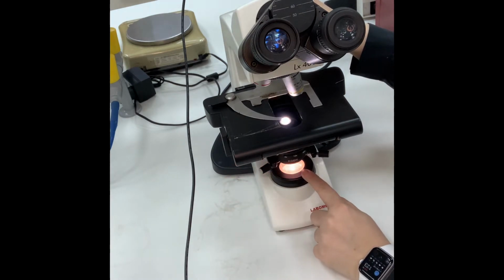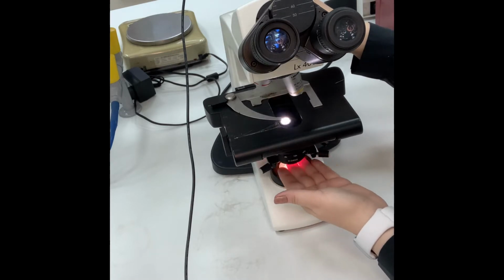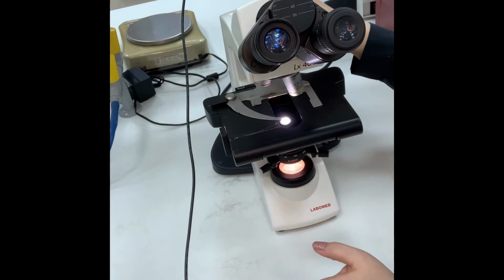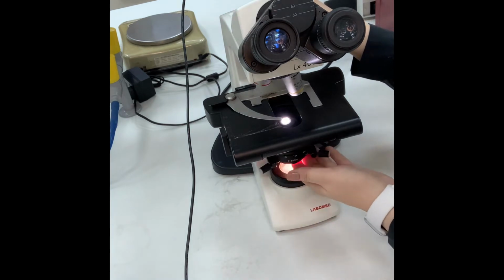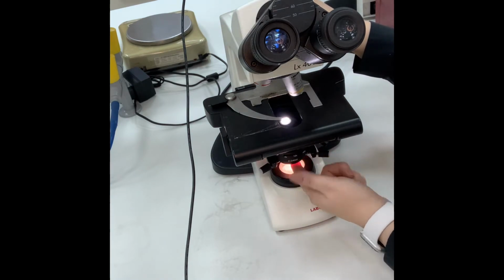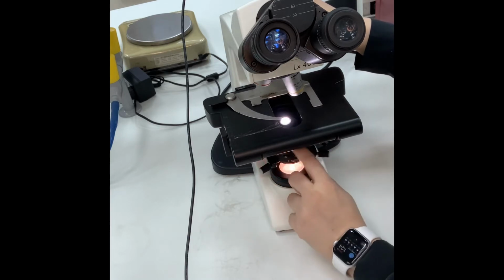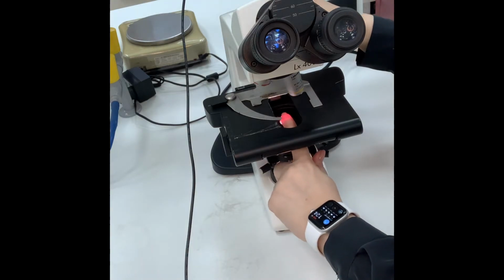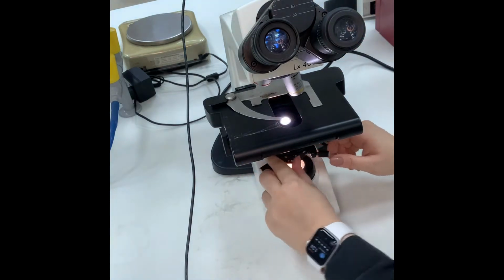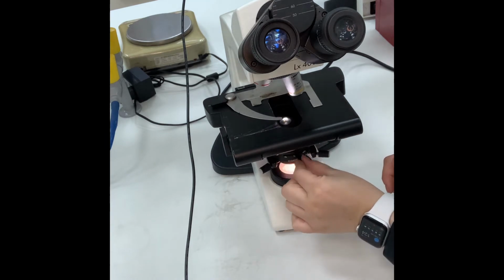of the light itself. Now under the microscope over here there is a lens. I cannot show it to you, I cannot remove it, unfortunately. Usually when you are in the lab you can just bend over and look at the lens. This is a reflect lens. It reflects the light over here to the condenser lens, and from the name, it condenses the light with the lever over here. See how it condenses the light?